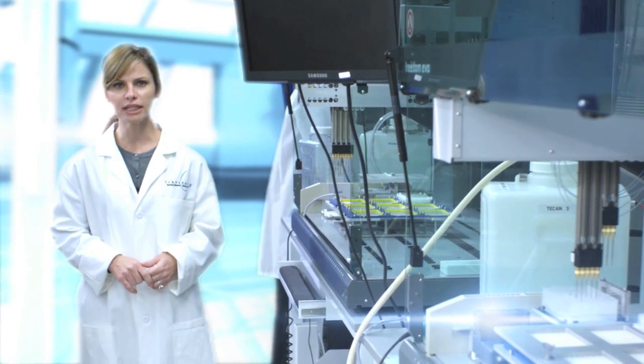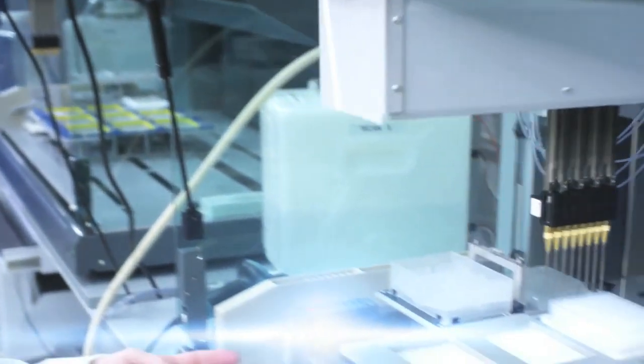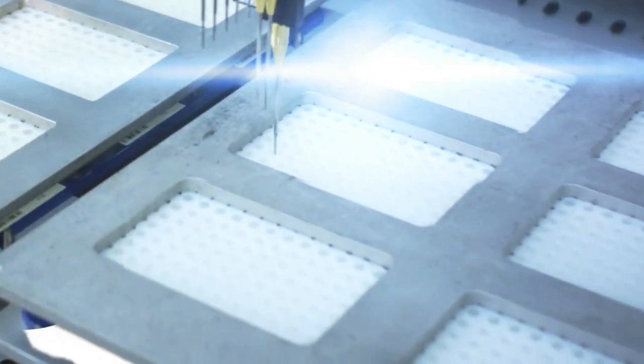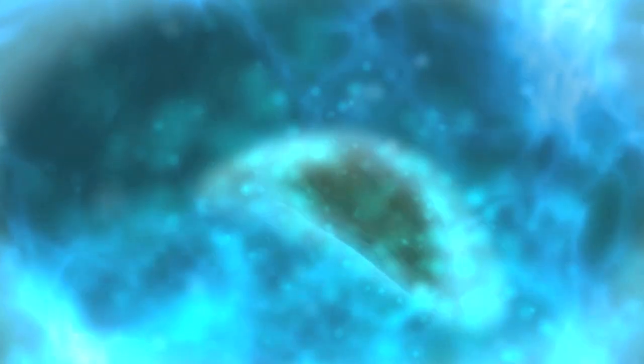Inside the Class 1000 cleanroom, the automation comes to life. The integrity of your sample stays intact as the robot pierces the rubber cap mat to begin lysing the tissue. Your sample stays sealed in the same plate just as you sent it to us.